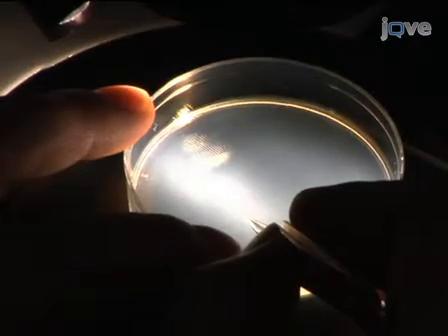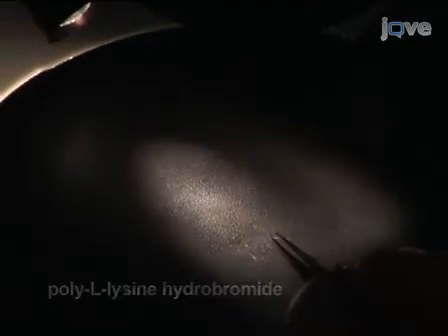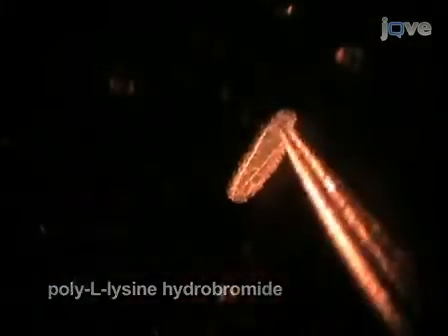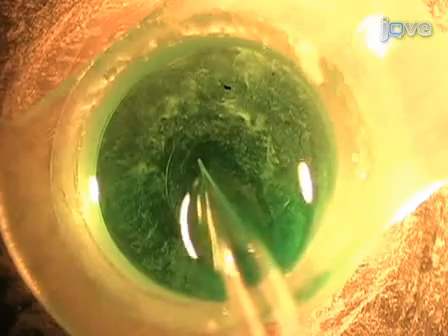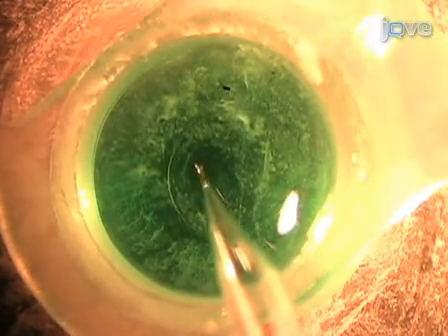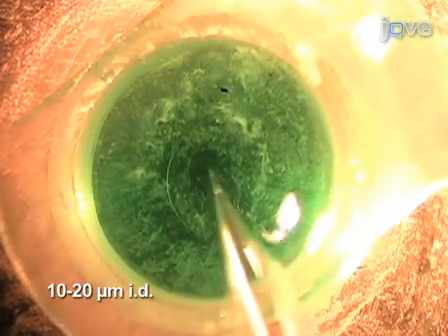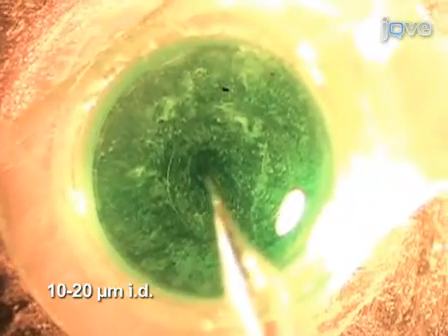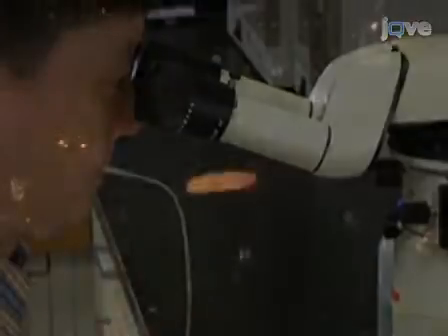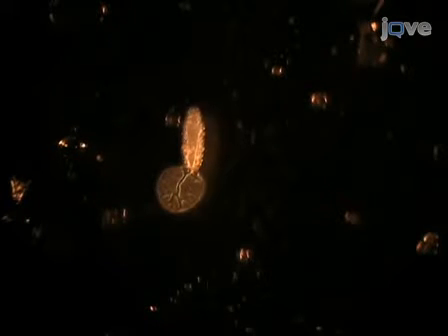Early-stage embryos will attach directly to clean glass or glass coated with poly-L-lysine. For older embryos, attach them to Silgard-coated coverslips by delivering surgical glue through a small glass pipette attached to a rubber tube. The glue flow is controlled by mouth pressure. Use small amounts of glue to firmly attach the head and tail, and do this carefully because the glue polymerizes quickly in the saline.